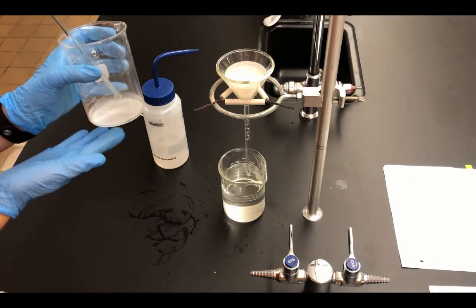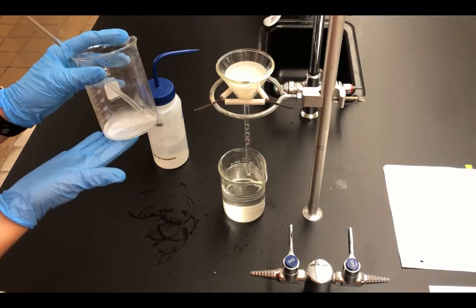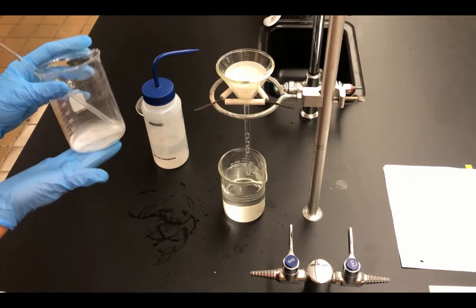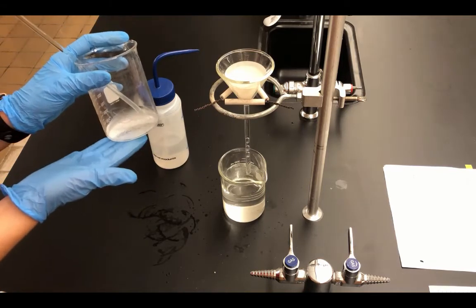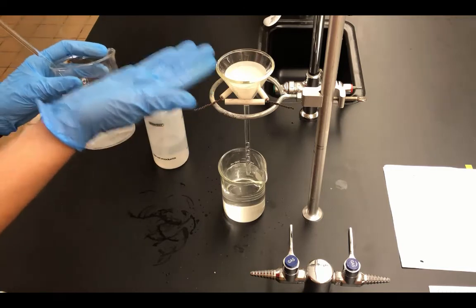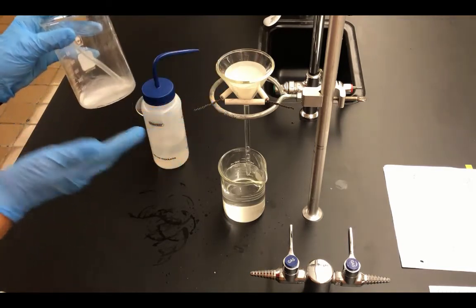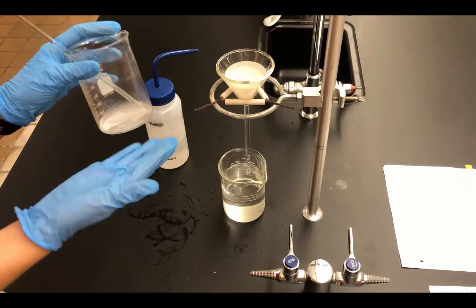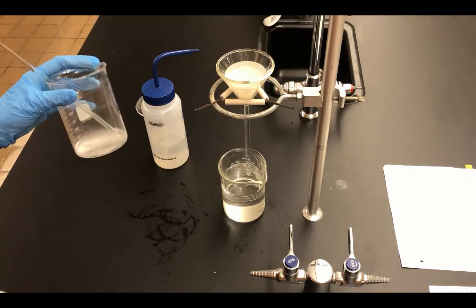Now, there's always going to be some solid left over in the beaker, which should be part of your observations, because that means that not all of the solid is transferred into the filter paper. And so that is one potential source of error. We cannot get 100% transfer.